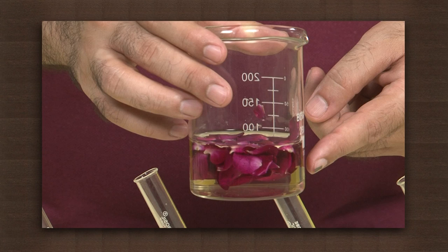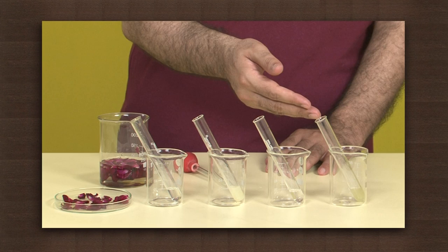We will use china rose and test it with a few acidic and basic solutions. We have dilute HCl, lemon juice, sodium hydroxide solution and soap solution.